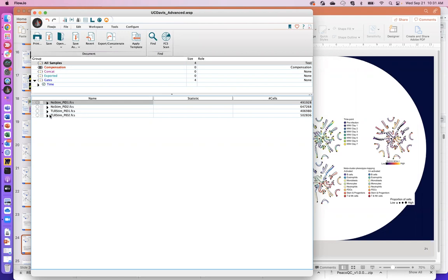So when you are at home or at work, and you're looking at your data and you want to annotate it for analysis in high D, what I would recommend is write out all the different experimental variables that you have present in the data set, and then add those as keywords to your data.